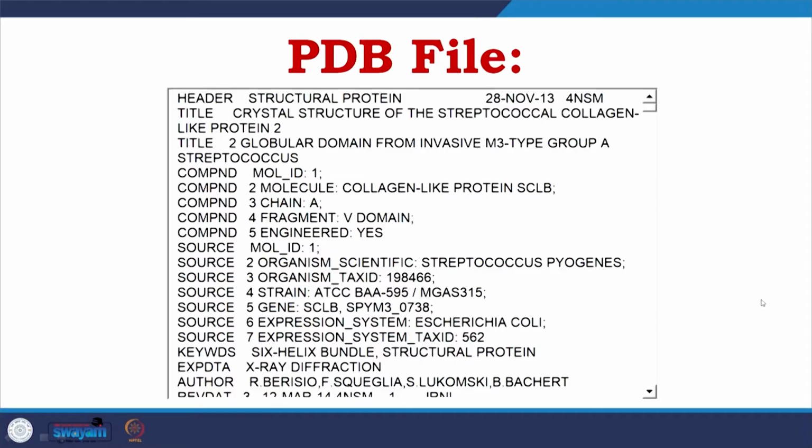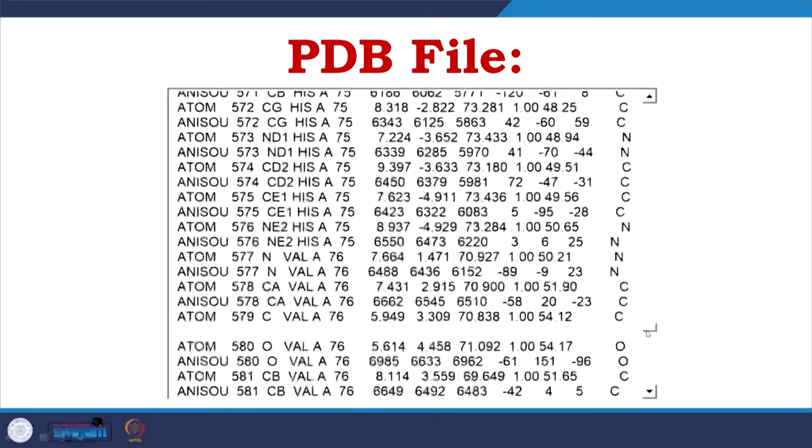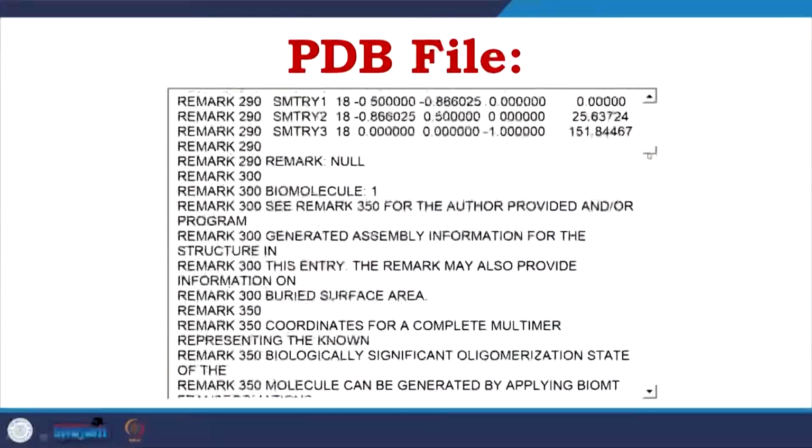So, this is a PDB file, and the reason I have given it, if you click it here, you will see that it is a huge file. I hope you could understand, it is a huge file.